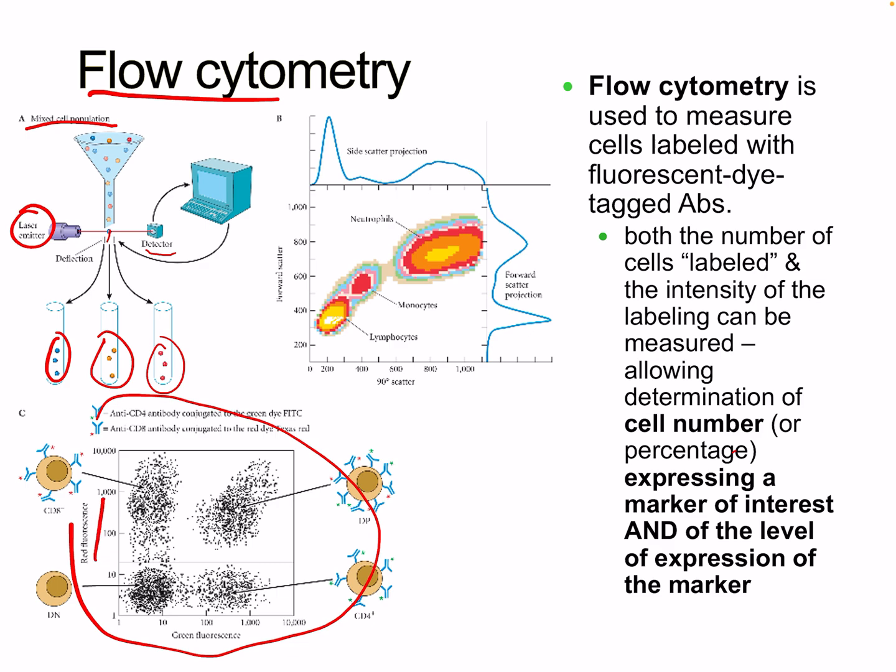so red, here's our red, here's our green, and it's kind of a scale. So if something's in the corner, it's highly green. You know what I mean? So we can see charts. Essentially, what you'll see in these graphs is pooling, usually, of certain cells in a certain area. So we know that green's going to be all in one area, red in one area, and then cells that aren't either might be spread in between, and then the computer can count.